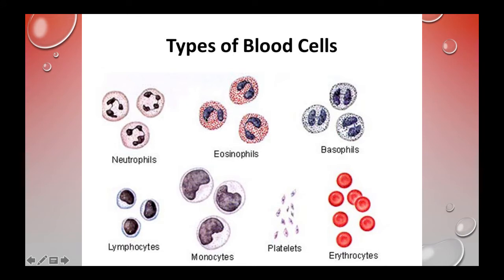And then we have our eosinophils. Our eosinophils have a bilobed nucleus. They look a lot like the neutrophils, except they usually have just 2 large lobes connected in the center. They have cytoplasmic granules, and the big thing that is different for eosinophils versus basophils is that they stain orangish red, really red.